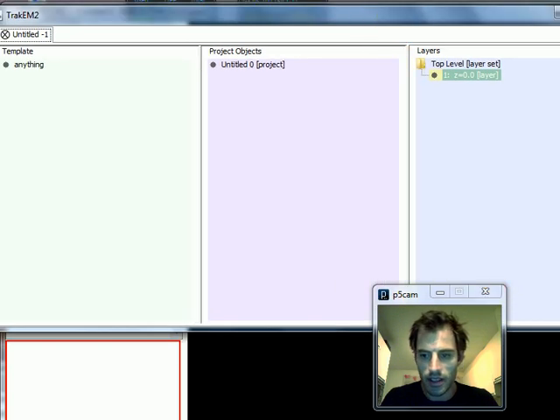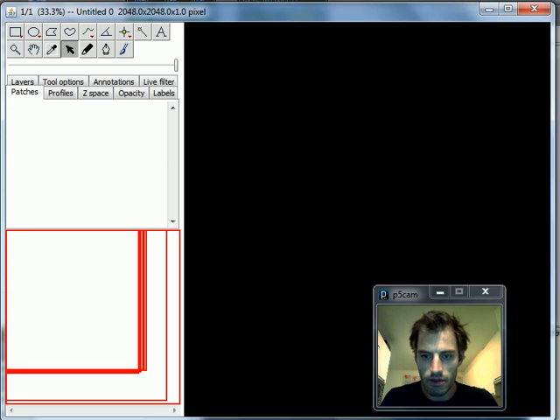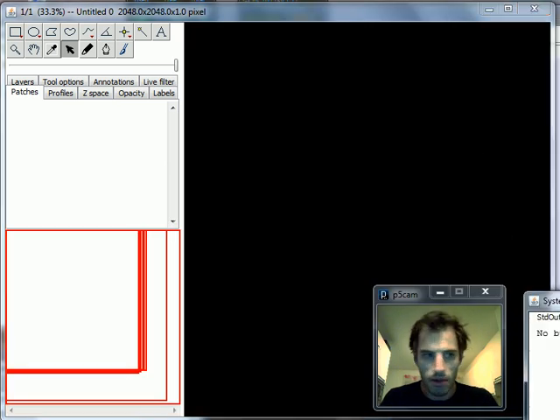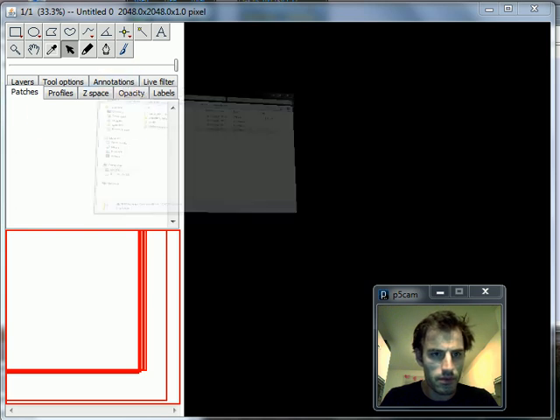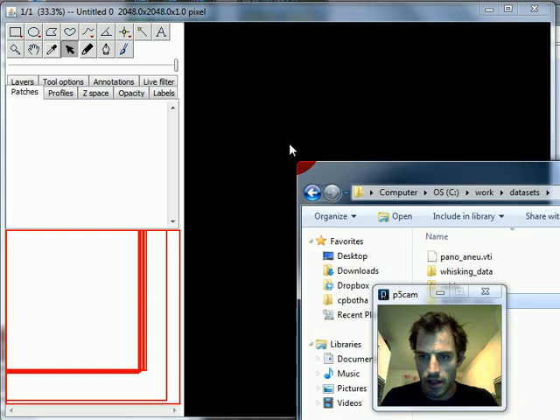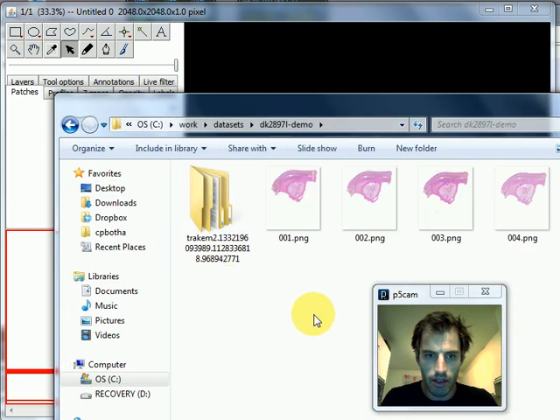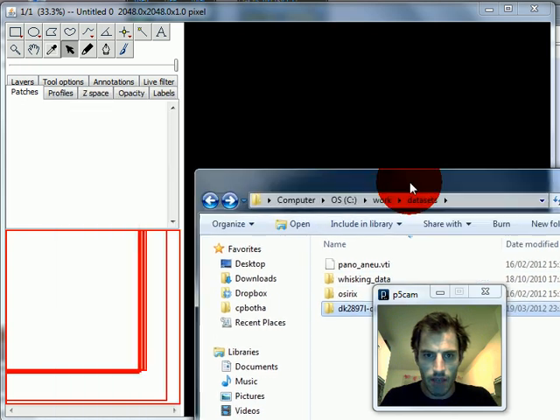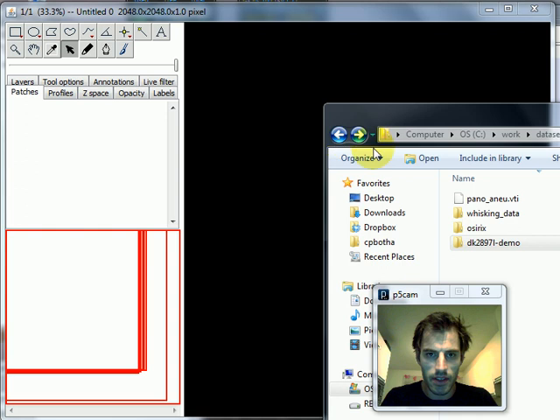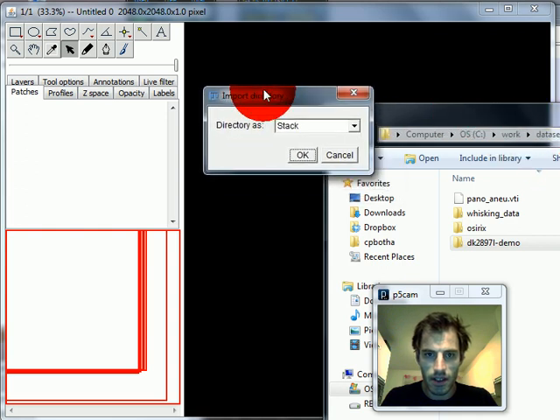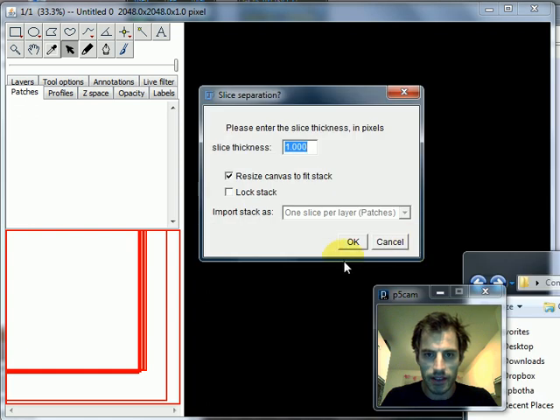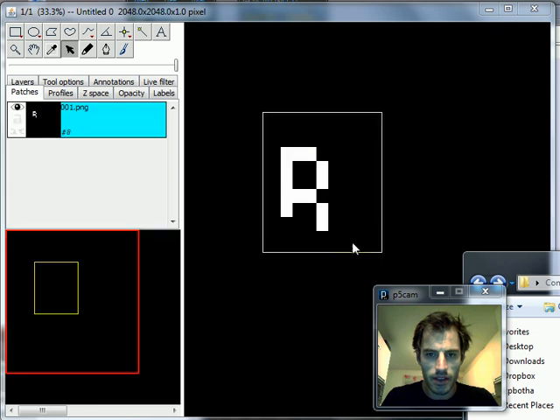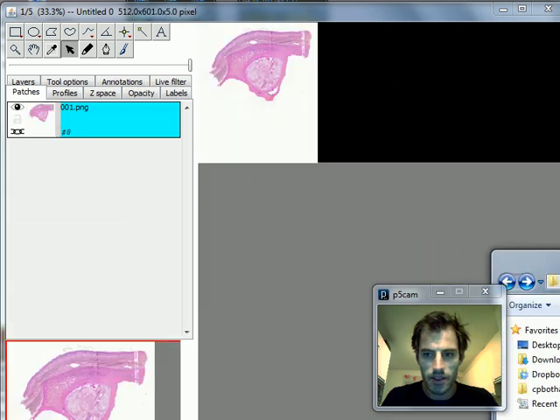To open that I did File > New > TrakEM2 Project. What I'm going to do now—I've prepared over here a small directory of unregistered slices—I'm going to drag that whole directory onto the canvas and tell it to call it 'stack'. It asks me about the slice thickness, I pick the default of one and keep the defaults. So there it loads my data.